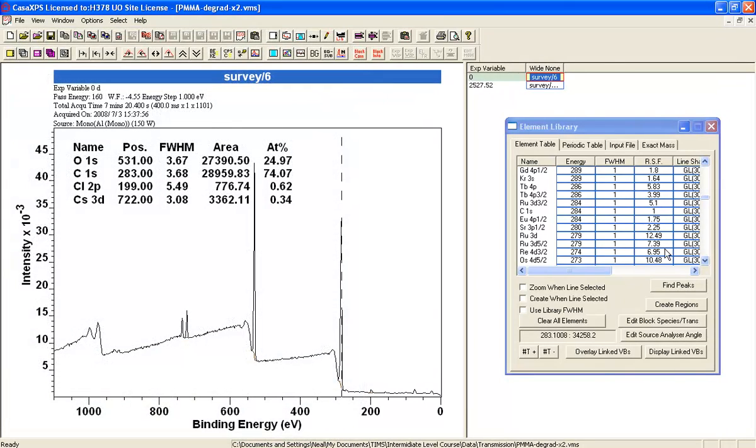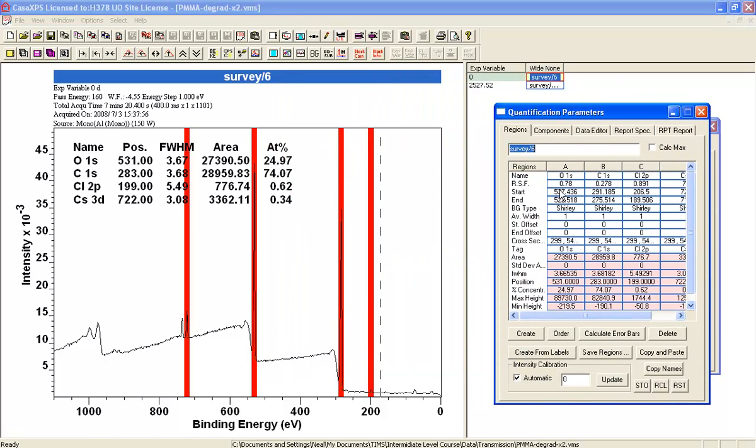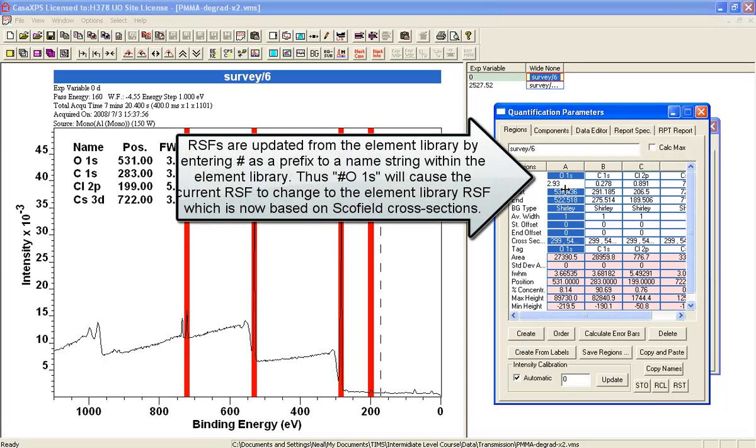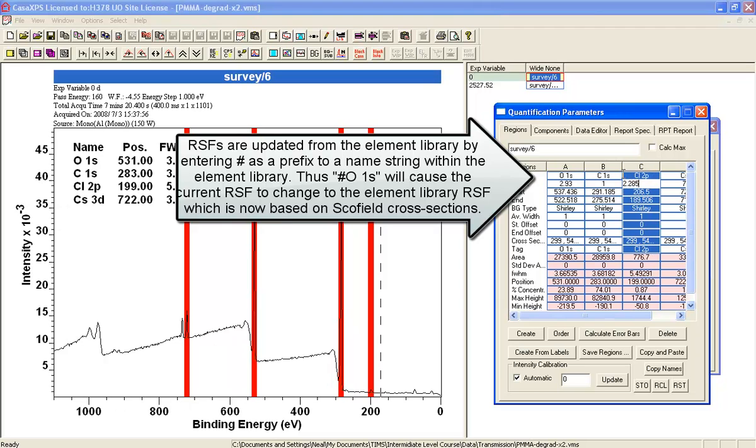If we update these RSFs, taking them from the original Kratos ones, if we update by putting a hash in front of each of these names that are also in the element library, then you'll see that the RSFs are all updated.